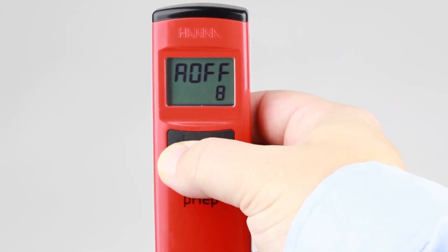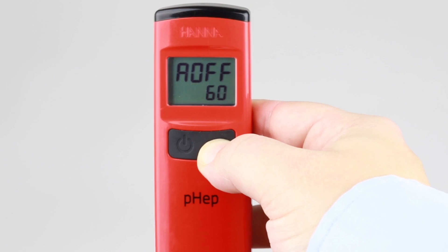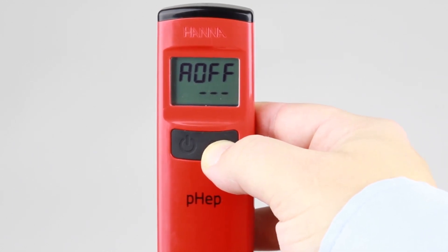Pressing the on-off button moves to the next setup option, which is for automatic shutoff. The default setting is for 8 minutes. Pressing the CAL button cycles through to 60 minutes, then disabled, and finally back to 8 minutes.